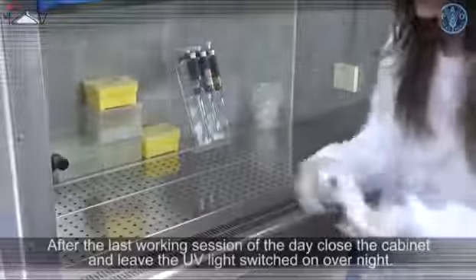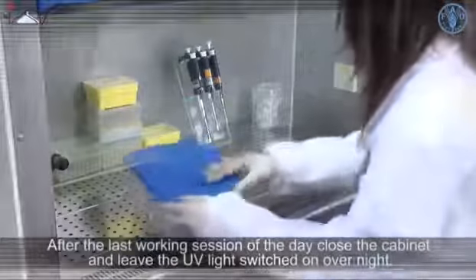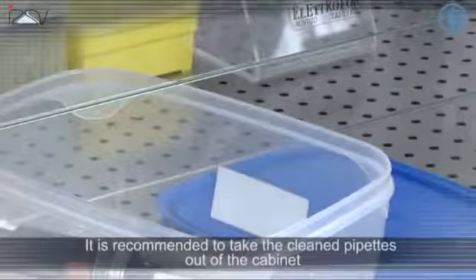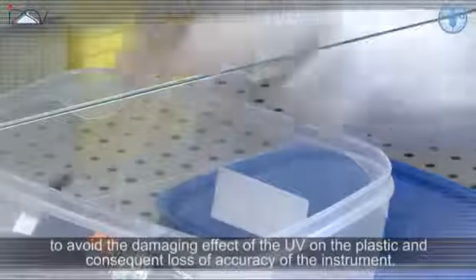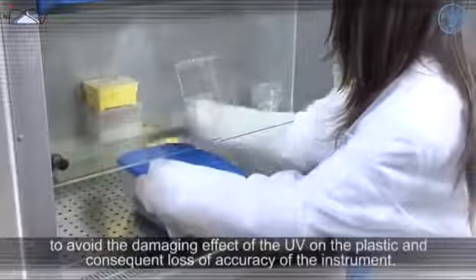After the last working session of the day, close the cabinet and leave the UV light switched on overnight. It is recommended to take the cleaned pipettes out of the cabinet to avoid the damaging effects of the UV light on the plastic and the consequent loss of accuracy of the instrument.